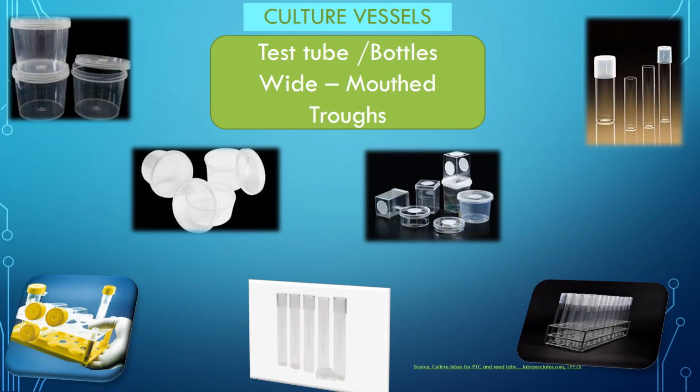The next item is the culture vessel. The containers in which the explants are cultured are called culture vessels. They are test tubes, bottles, wide mouth troughs. All the vessels are fitted with lids that fit tightly. Additionally, they may also be fitted with membrane filters through which air exchange can occur while maintaining sterility. All the vessels are autoclavable and can be individually sterilized before use.